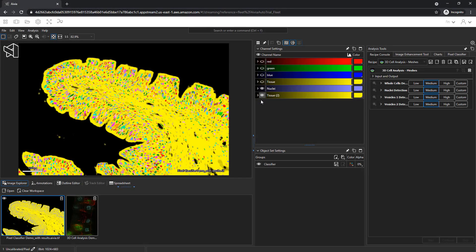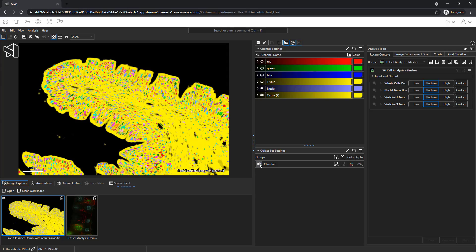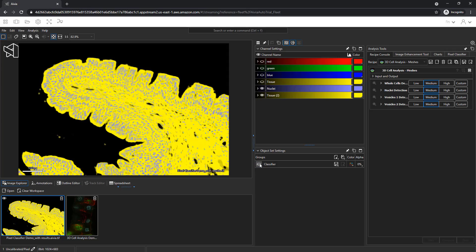Welcome to Avia. In this video, we will explore a demo dataset of the pixel classifier.